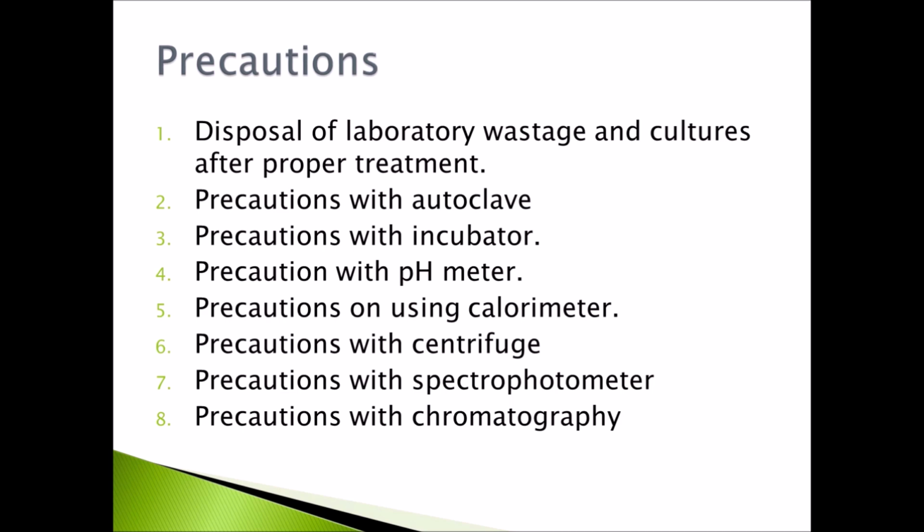To sum up, before starting, the rotor and lid locking mechanism is to be checked, and materials such as viruses, bacteria, and toxic chemicals need to be placed in biotubes with special airtight caps to prevent the development of aerosol formation.